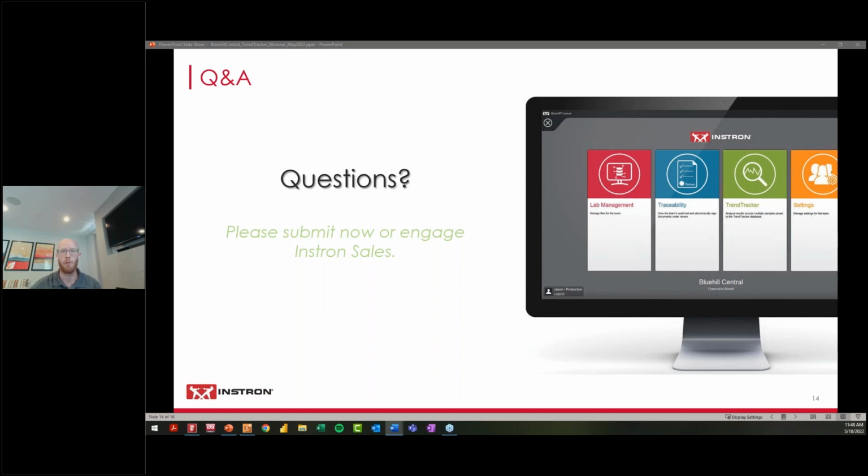So all new viewers would be viewed in what you've seen today. If you get a new system and you're buying software for that system, you'd be buying the very same plugin that you always do, and you could continue to view it in your old viewer.